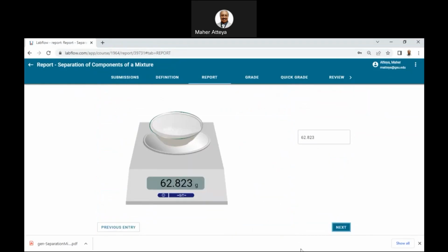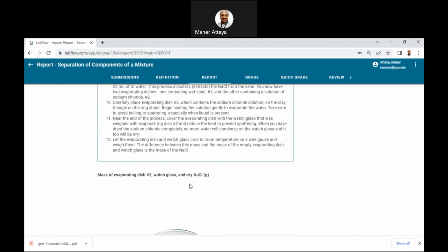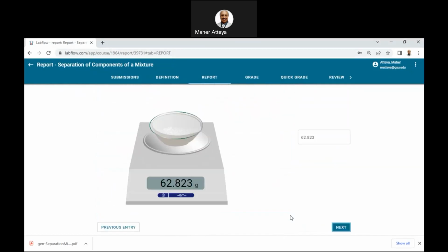Okay, so we have this one here, just double check. Okay, let me take this one here.